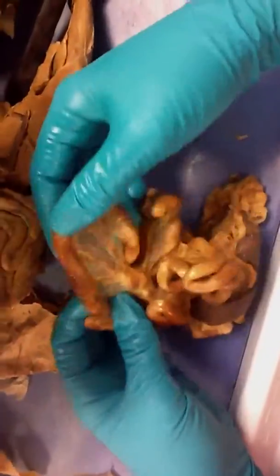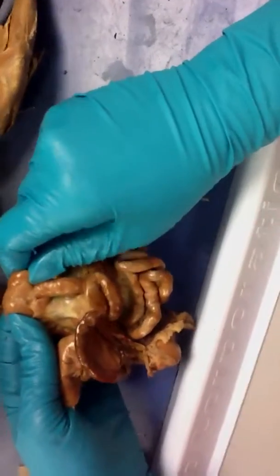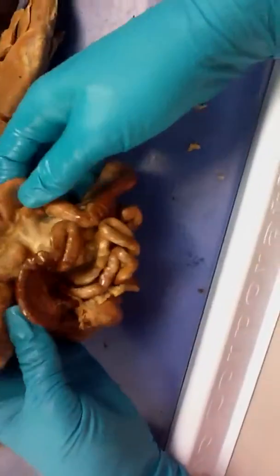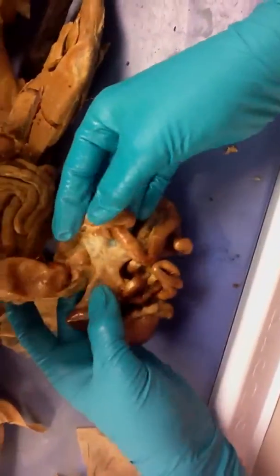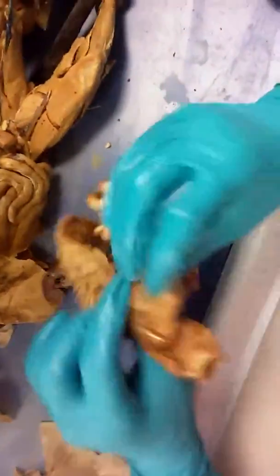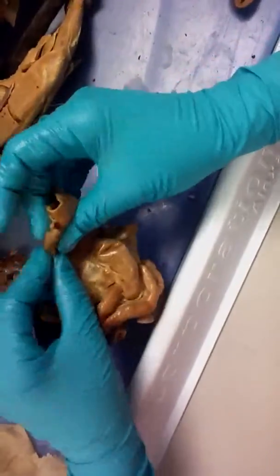And then we get to the last part. Okay, we have a little bend here. That's where our appendix is, or cecum is in another animal. And we have our colon. And you can see there's a few more right here and right here. There's a few more lymph nodes spread throughout. And then it goes out. And kitty poops. And that's it.